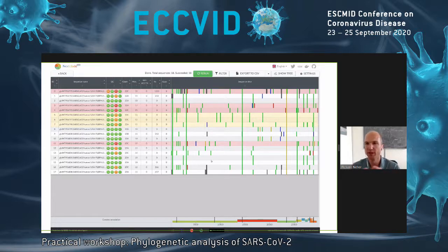This should be reminiscent of the alignment view that I showed you in the beginning, where you have some coloring of genetic diversity along the genome, right? And this is the very 5' end of the genome. This is the 3' end, and the spike protein sits roughly here. Now you also have these black bits, which in this case are just missing data. This is actually fairly common in these next generation sequencing approaches: as you try to amplify your sample, some parts of the biochemical procedures don't really work, and in the end you end up with gaps.